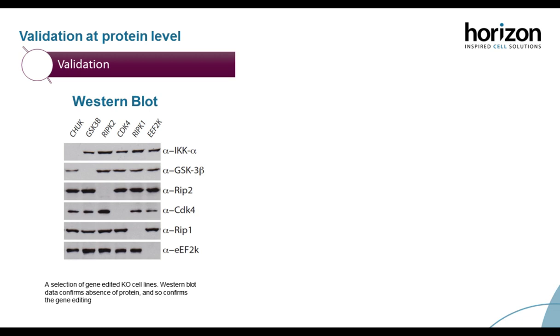In the example on the right, you can see the absence of this knockout protein was detected using immunofluorescence. In the wild-type cells, you can see the green staining, and in the knockout cells, you cannot see this green staining. And this would indicate that the cells are knockout for that gene, SLC30A6.